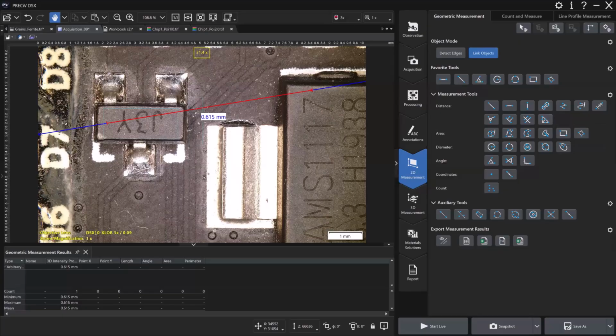This is more medical device oriented. Is the software certified? Like 21 CFR 820 or ISO 13485, that sort of thing. Another great question. Yeah, it is not CFR 21 Part 11 certified. Part 11, yeah.